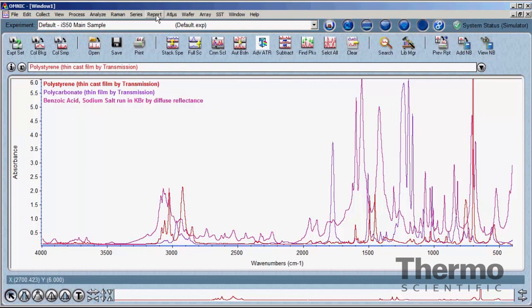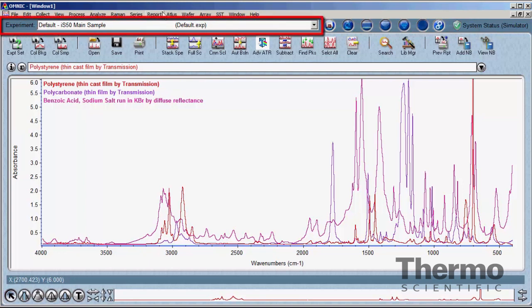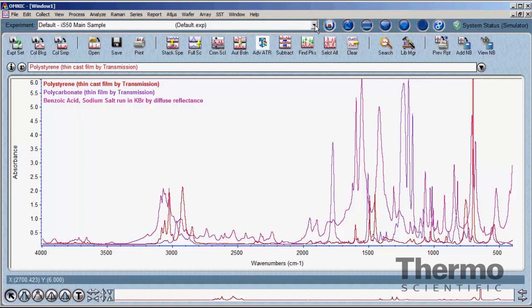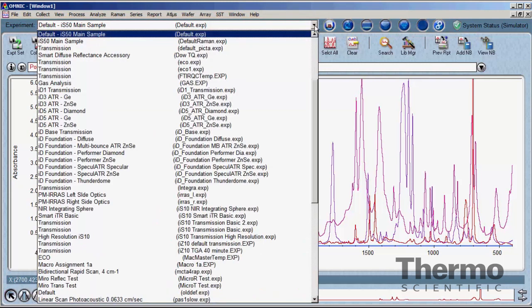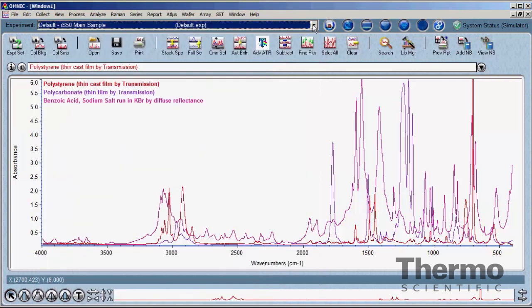Directly below the menus is the experiment bar. This is a convenient place to recall complete experiment parameters that have been previously created and saved. Spectral resolution, data collection time, beam path configuration, and all other parameters needed to collect a spectrum are contained in experiment files. These are useful in standardized analyses to assure consistent and comparable results. Creating experiment files will be covered in the experiment file tutorial.